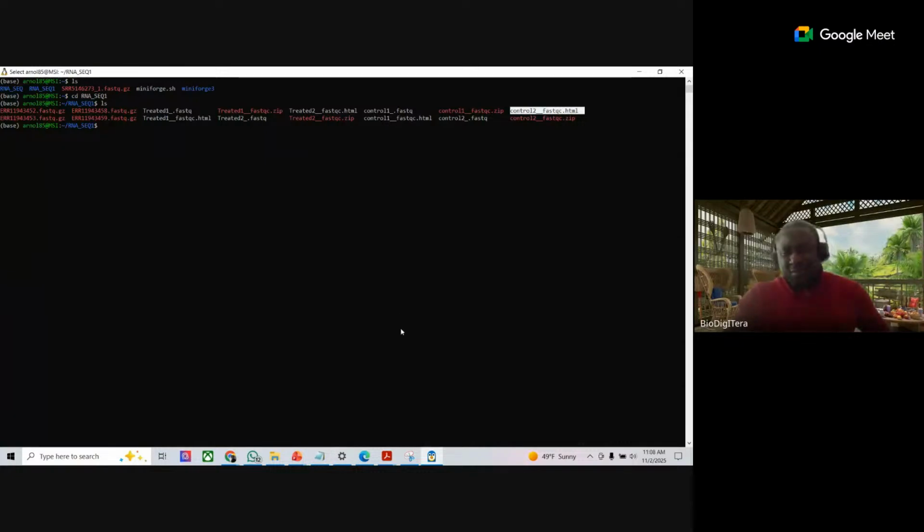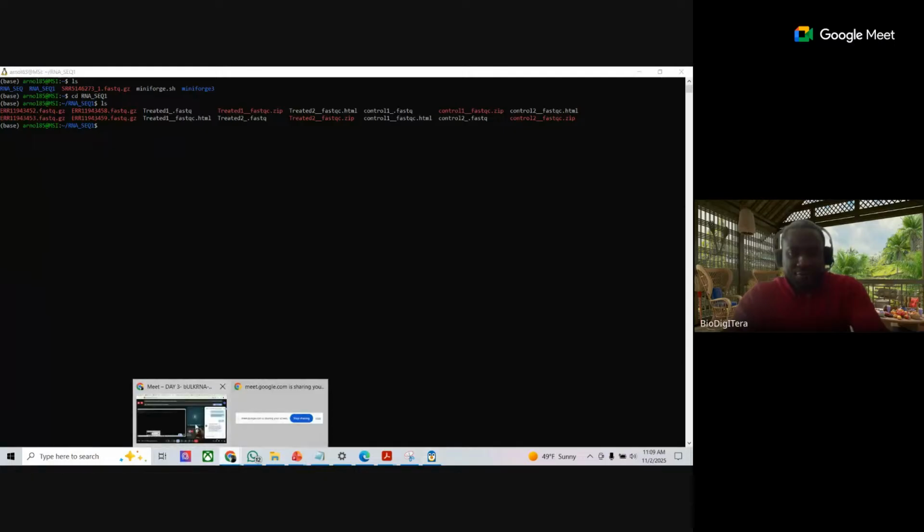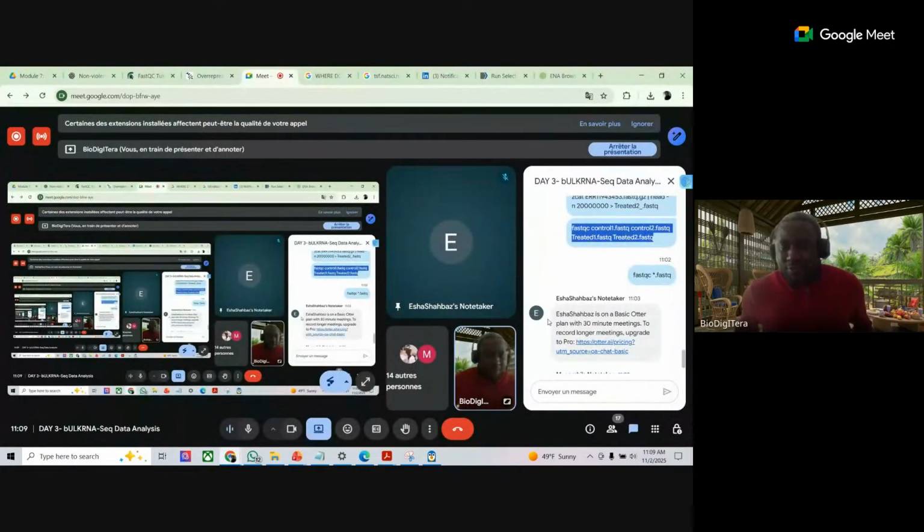Can you share your screen? Because if you don't share your screen, I will not be able to help. I have to see what you did in order to troubleshoot with you. Let me know if other people have done it already. Guys, if you have done, can you give a thumbs up? If you are seeing a file like HTML.